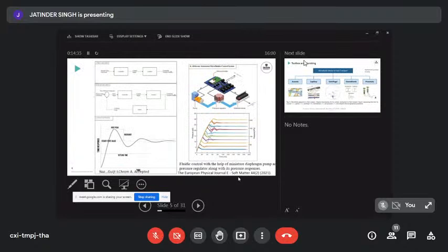So we've got two different ways of controlling our fluidic systems. There is open loop control, where you say, I want 5 microliters a minute. You close your ears and eyes and anything else, and you just hope that 5 microliters a minute will come out. There are closed loop systems, where you say, I want 5 microliters a minute. It's being put out, it's being measured, and it's being fed back through an electronic loop to say whether your 5 microliters a minute is actually being delivered or not. If it's not delivered, then the pump will be set differently to achieve the desired flow rate.